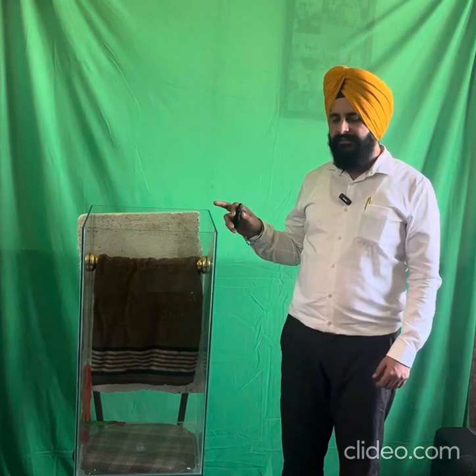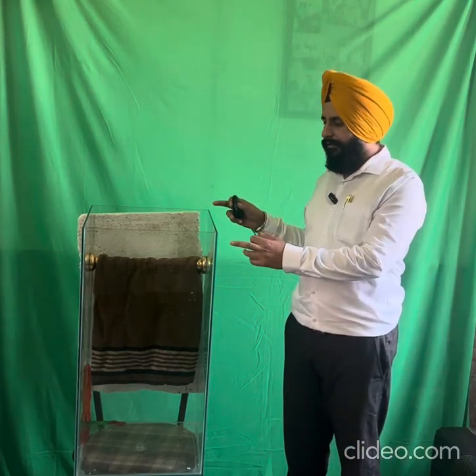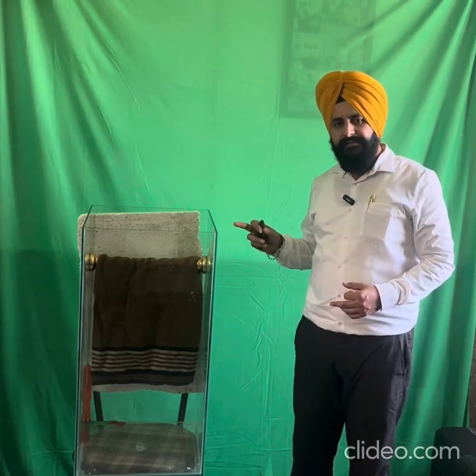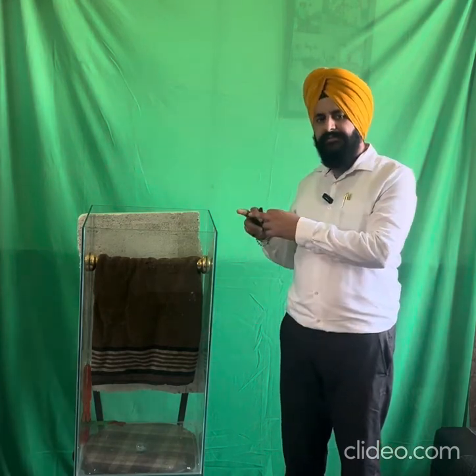This instrument, called the Strength Glass Chamber, is a novel instrument which has been used and validated by us in our lab, and we have already published some research papers. This is a glass apparatus with a width of 40 centimeters, length of 80 centimeters, and a lower bottom area of 40 centimeters — so width is 40 cm and height is 80 cm.